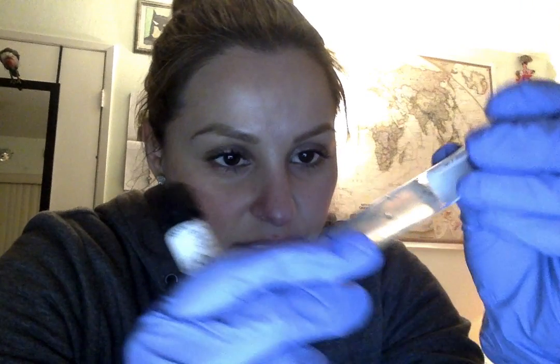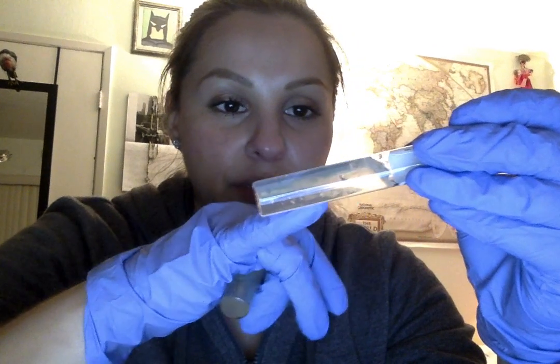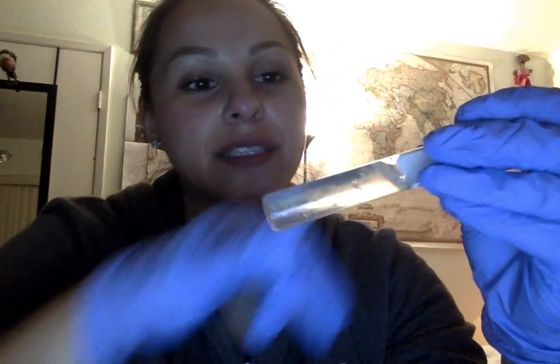And in the other one, the S. epidermis, this one's not as clean as I wanted it to be, but it's kind of hard to tell now. But you can see some of the stabbing. It's kind of hard to see, but there is a stab going this way, and then one kind of this way. My results were still clear enough for me to tell whether it was motile or not.